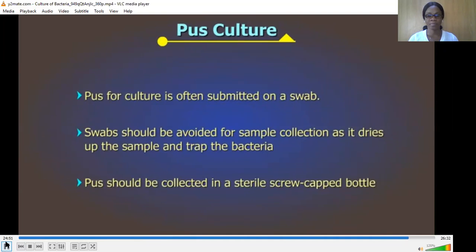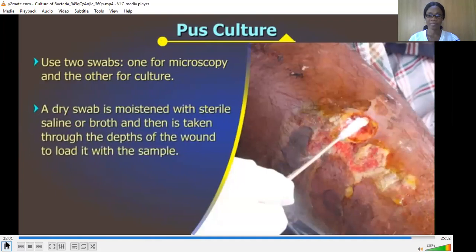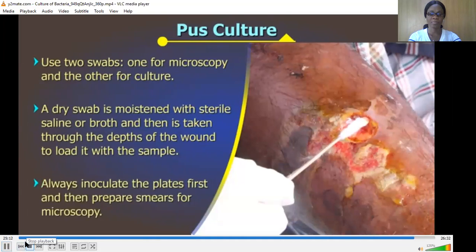If, however, a swab is decided to be used, use two swabs, one for microscopy and the other for culture. A dry swab should be first moistened with sterile saline or broth and then should be taken through the depths of the wound or lesion to load it with the sample. Always inoculate the plates first and prepare smears for microscopy.